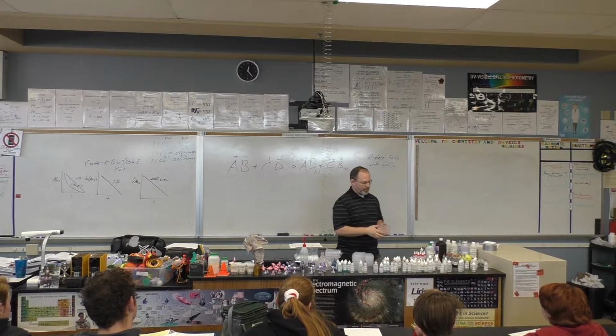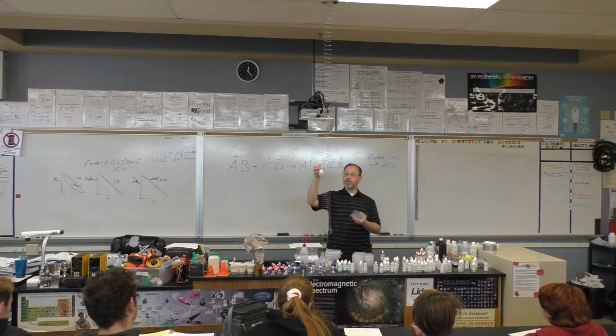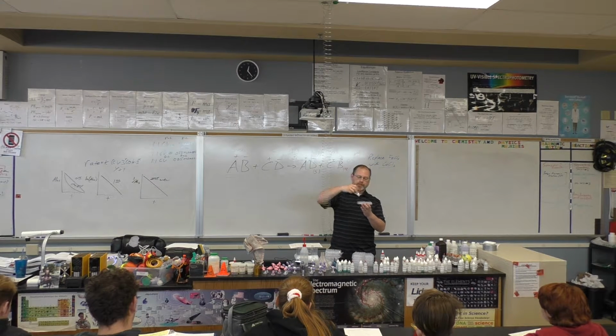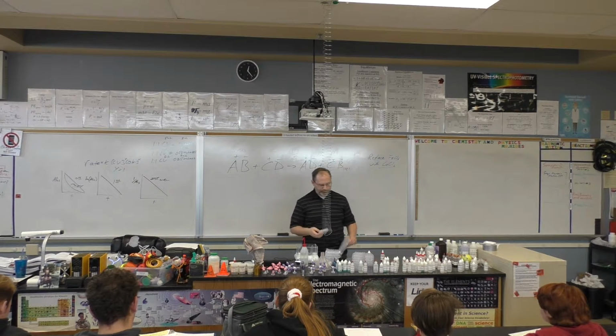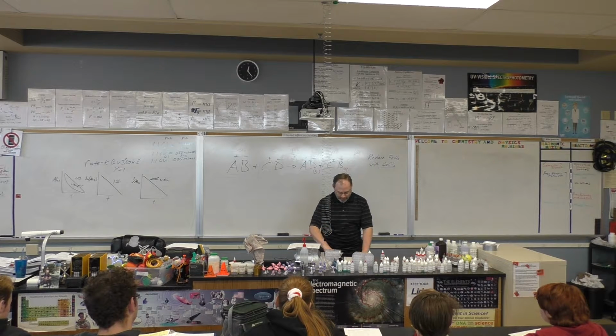And then you're going to get a compound, cobalt chloride. And into the spot plate, you're going to add some drops of the cobalt chloride. Drop, drop, drop, drop, drop. Then you're going to choose something else. Sodium hydroxide. Drop, drop, drop, drop, drop. And you're going to look at it. Did a precipitate form? So to figure out if a precipitate formed, get a piece of scratch paper, put it on your desk, and go black, white, and see if it turned cloudy.